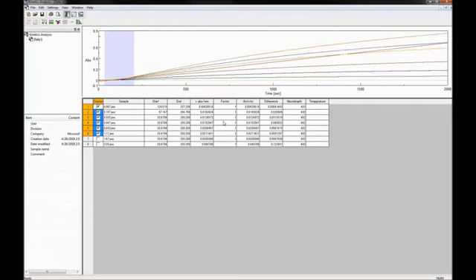The activity is the slope of the line, which is determined using the least squares method and is multiplied by a factor or reaction volume. If you would like to determine the specific activity, the units will differ and the factor needs to be adjusted accordingly. The difference column reports the difference in the absorbances of the calculating or blue shaded region.